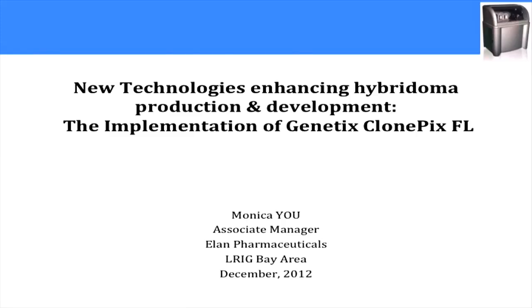So today I'll be talking about Genetix ClonePix FL and how we incorporated this technology into our workflow to make our hybridoma facility more efficient and more productive, and also how it helped us to overcome some common issues that we faced before the technology was brought into our facility.